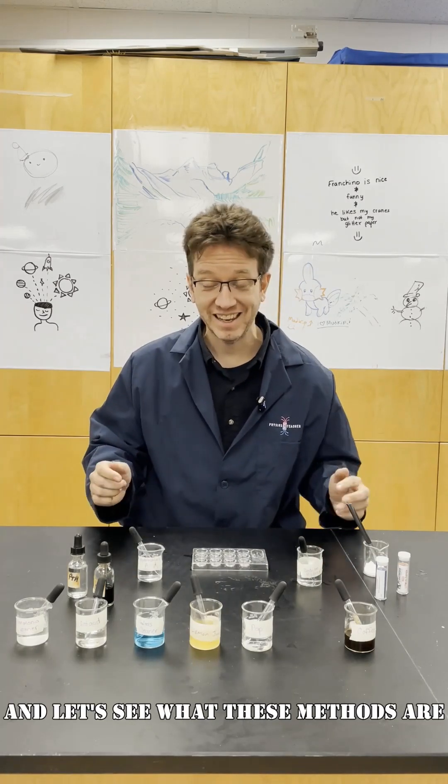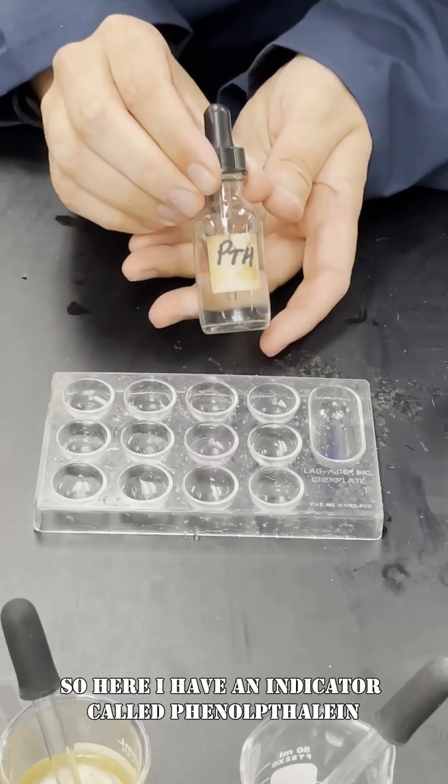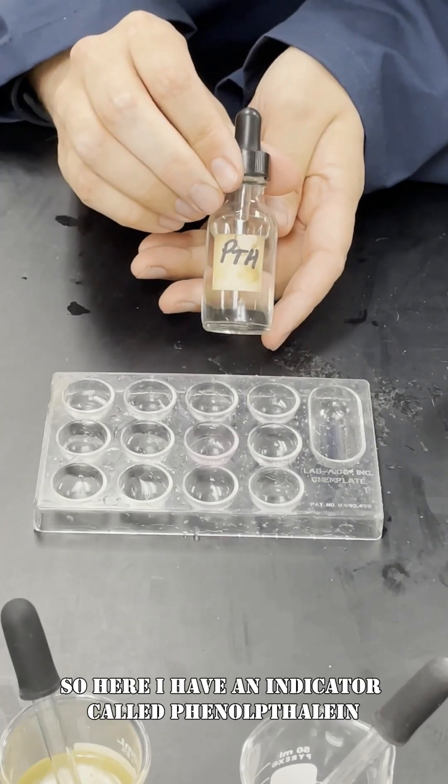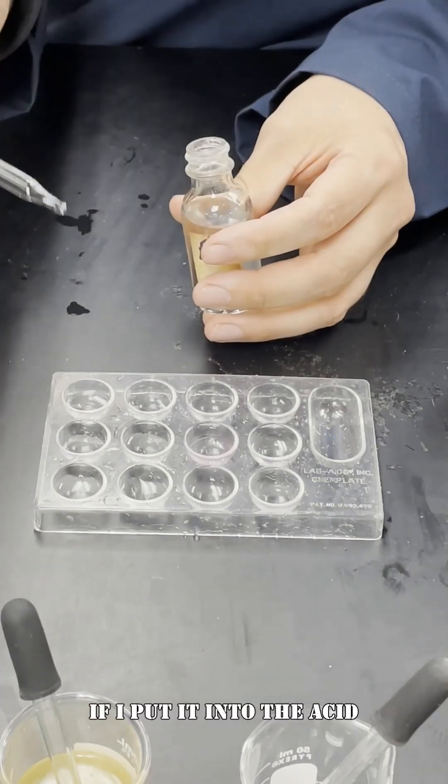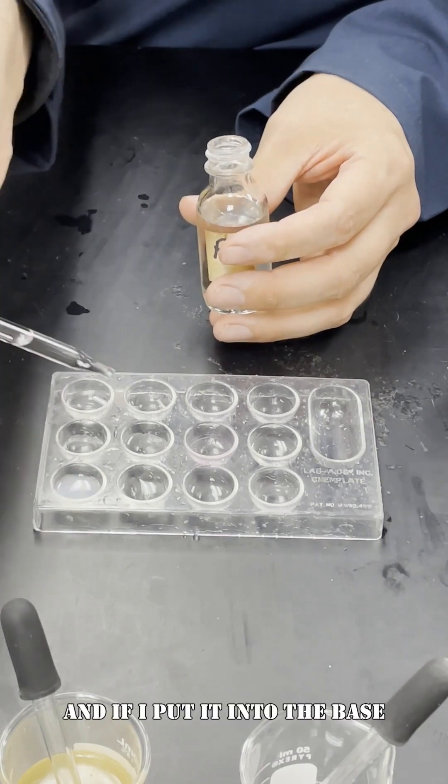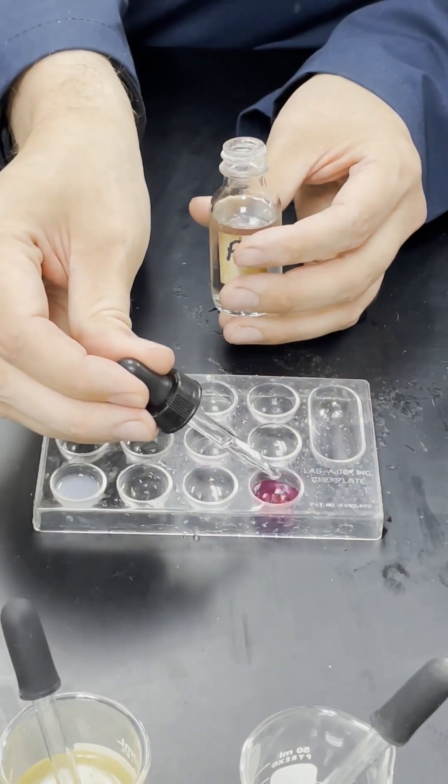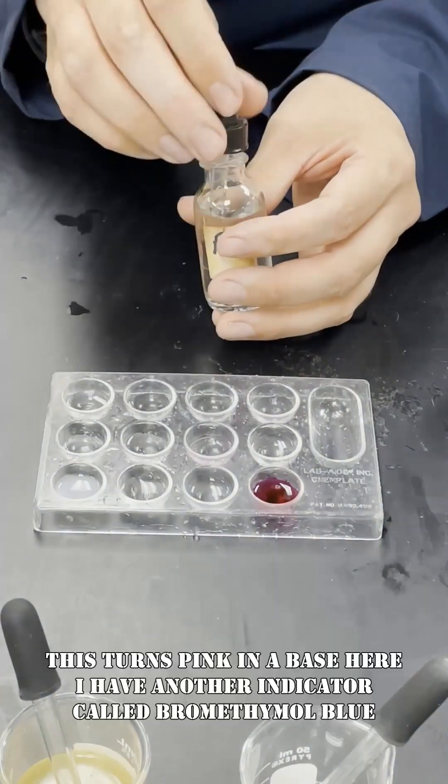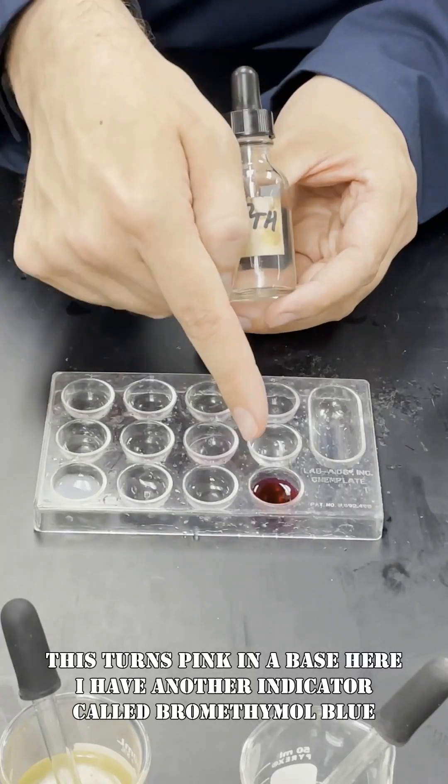Now come a little closer and let's see what these methods are. So here I have an indicator called phenolphthalein. If I put it into the acid, and if I put it into the base, whoa, this turns pink in a base.